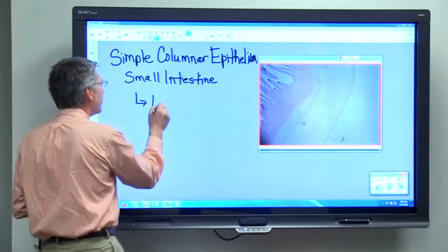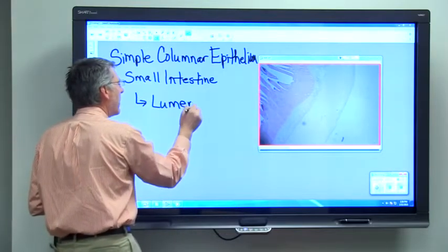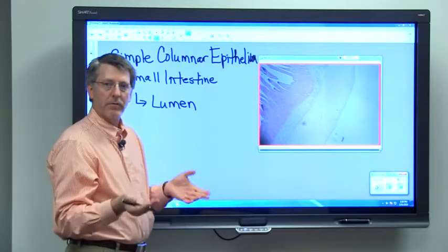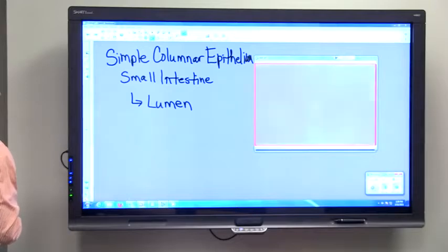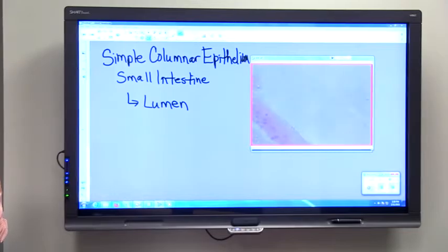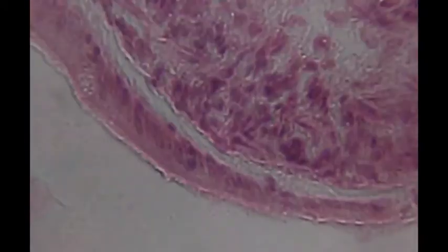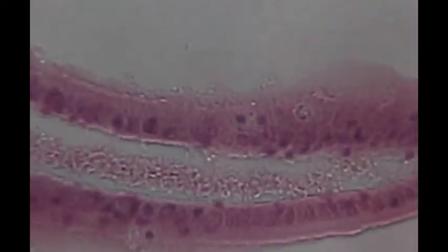The lumen of the small intestine is what the food actually moves through. The lumen is the hollow space inside the intestine. There are a lot of little finger-like structures that project into the intestine. You'll learn about those when you cover the digestive system. But what we want to do is go up to higher power and look at this tissue in more detail. I'm going to adjust the microscope so we can see the tissue that we're interested in.